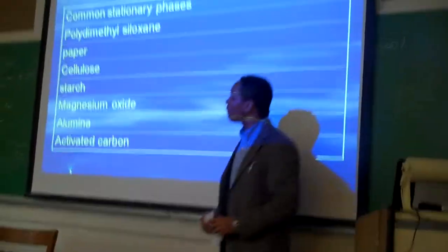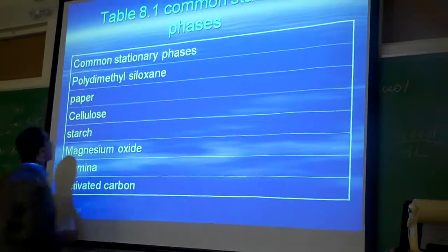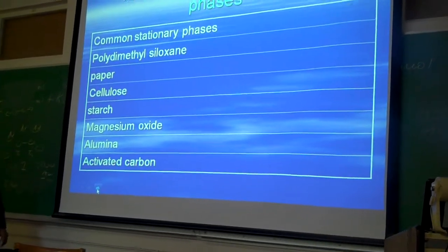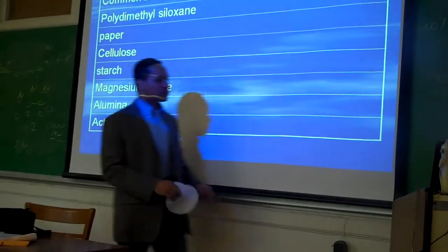And these are common stationary phases in your text. Your stationary phase today will be paper, starch, activated carbon.